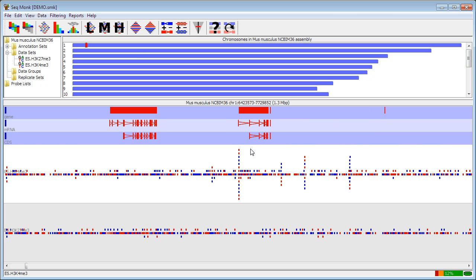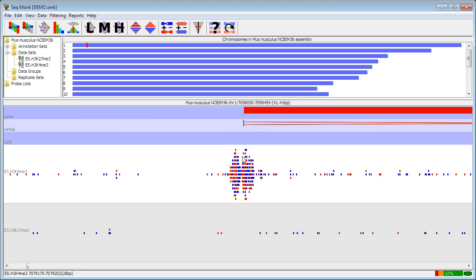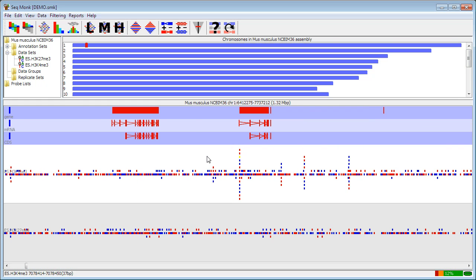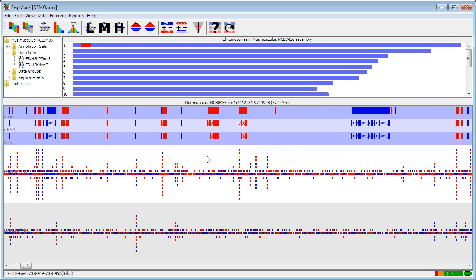But there are limitations to what you can do with this. You have to look at each region individually. You can't systematically go through all of your data. And also, because of the limitations of what you can display on screen, what you're seeing is not always a completely quantitative view of your data. So to get around this, we have some quantitation tools within SeqMonk.